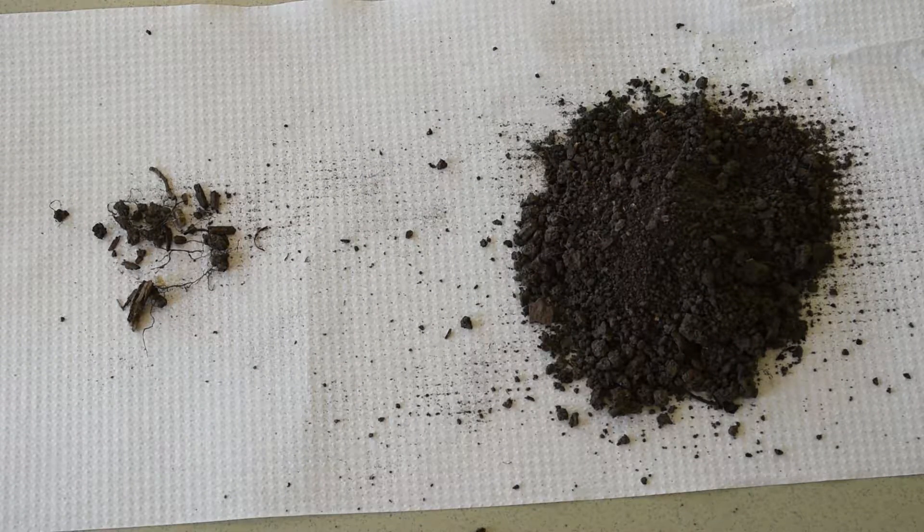The first thing to do when performing a soil texture by feel is to separate out all the organic materials and stones from the soil. When measuring soil texture, we are measuring the mineral sizes, not the organic matter. The reason you get rid of stones is because stones are bigger than two millimeters in diameter, and that's the largest size of sand particle considered to be soil.